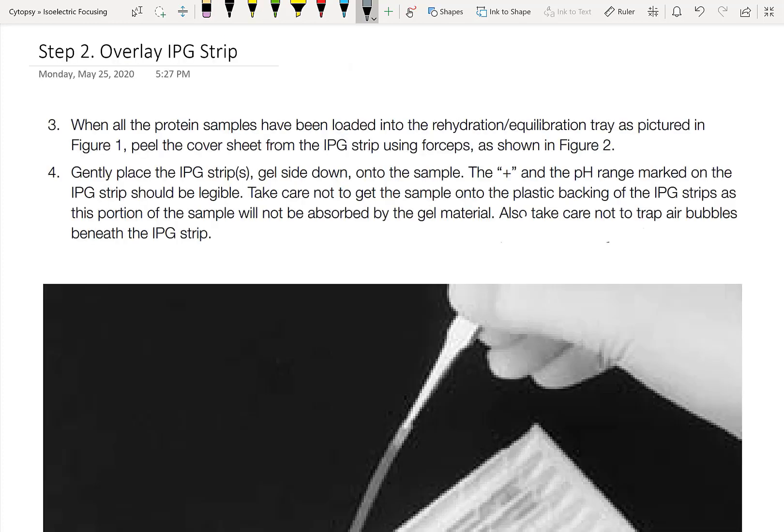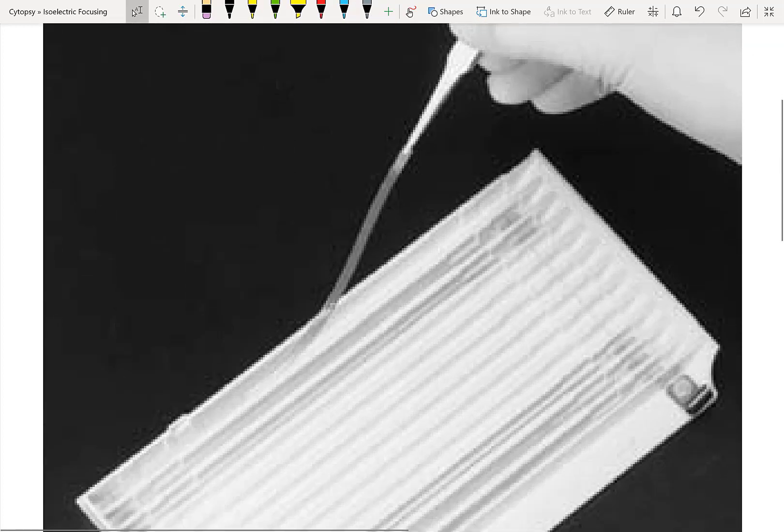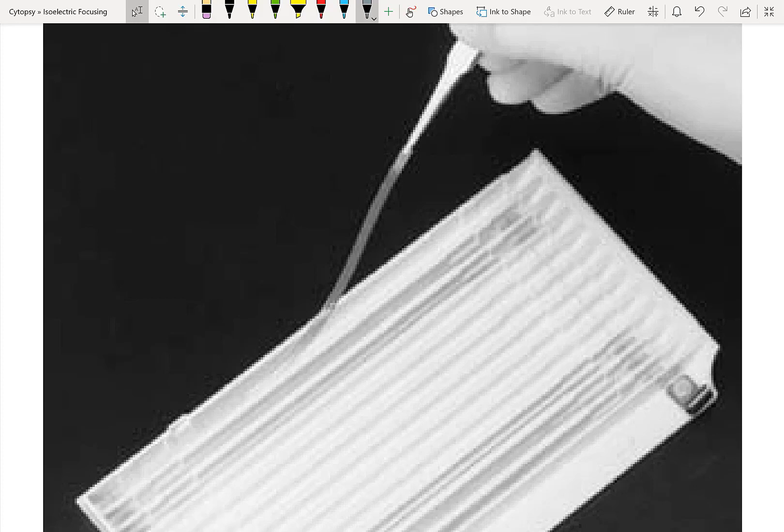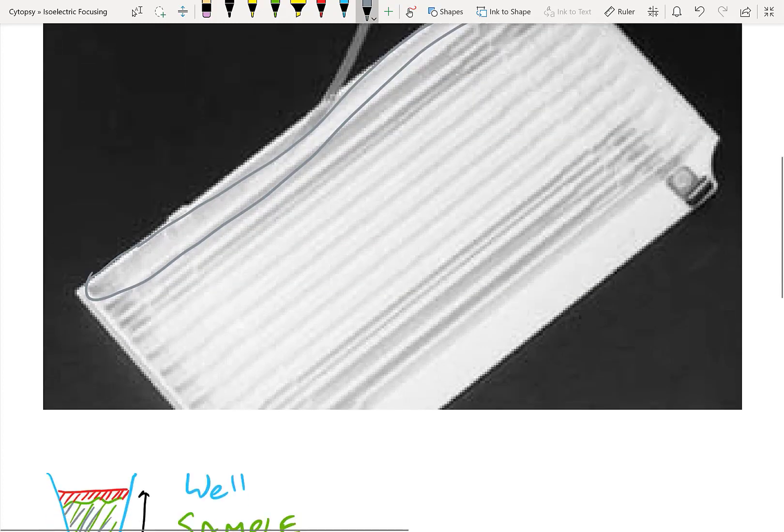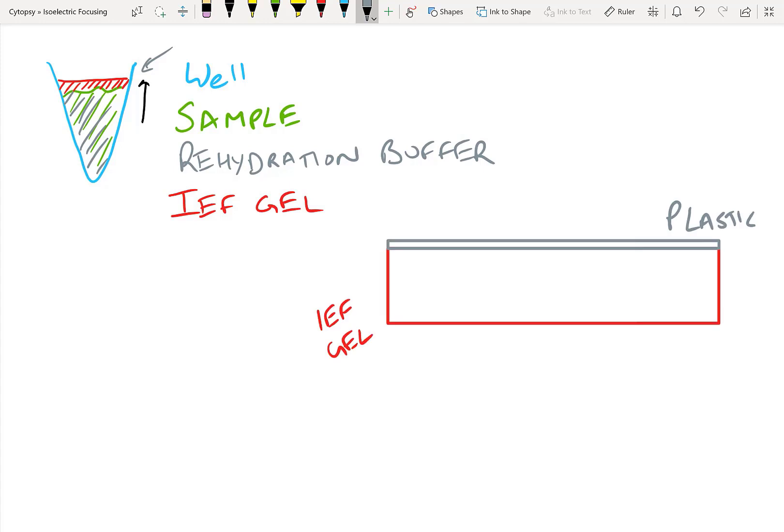This is just so that we can later on dip our gel for the isoelectric focusing into this. Now at this point, our well looks like this: it's got sample and rehydration buffer just at the bottom of the well. Nothing fancy so far. Now in step two, what we do is we take the IPG gel and overlay it on top of our protein sample. In order to do that, we need to make sure that all of our proteins have been loaded into that equilibration tray, like in the previous step. And then we just put this IPG strip with the gel side down onto the sample. And here you can see it's pretty simple to use a set of tweezers and just lay the gel down so that it covers the entire lane. At this point, the idea is to make sure that our gel is completely overlaying our sample and at no location inside the lane to be having air bubbles, because air bubbles will prevent the gel from absorbing the sample at that location.